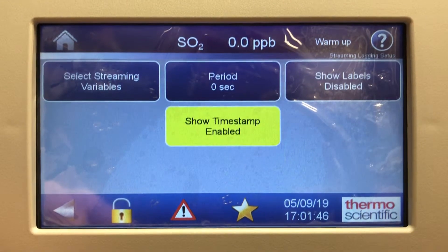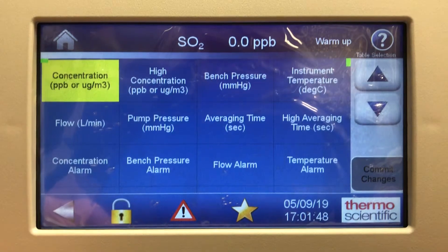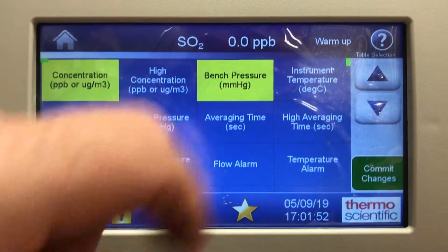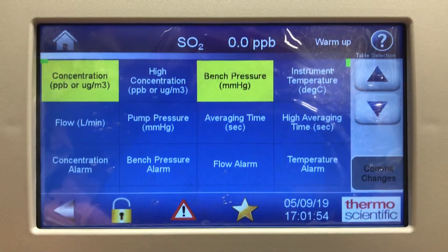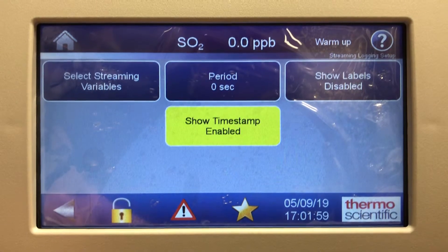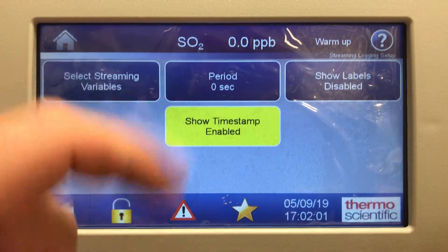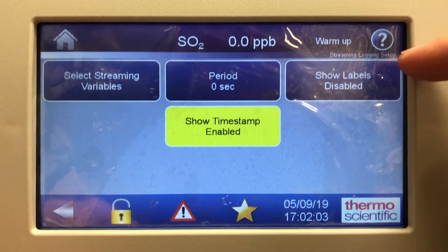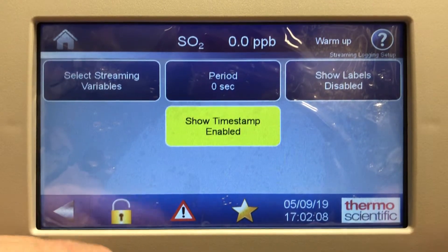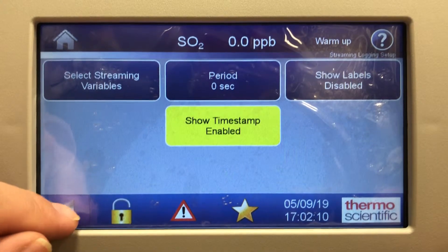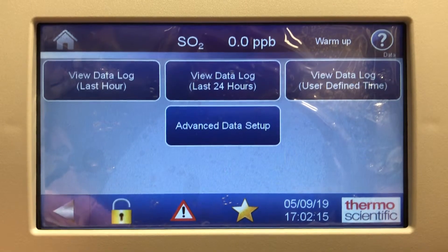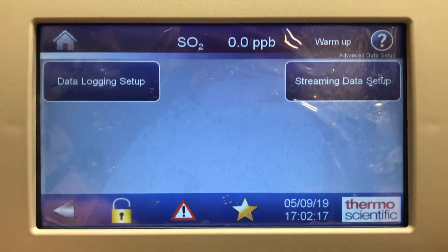There's also streaming data setup where you can select variables — for example bench pressure — hit commit changes, and configure the period in seconds, show labels, and show timestamp enabled. This is for streaming data out of the instrument. That covers advanced data setup.